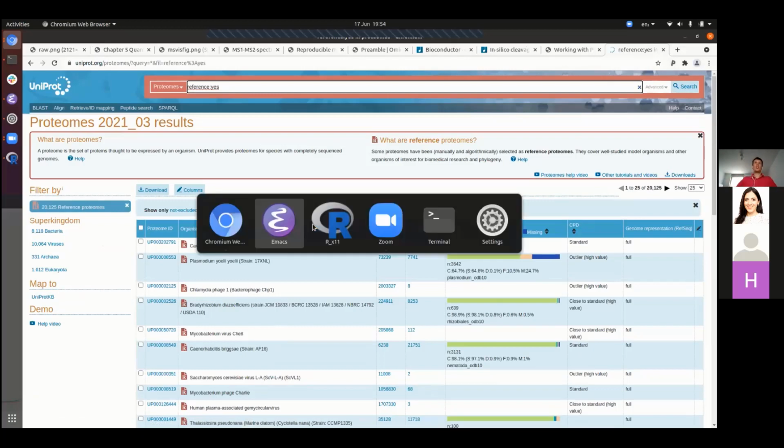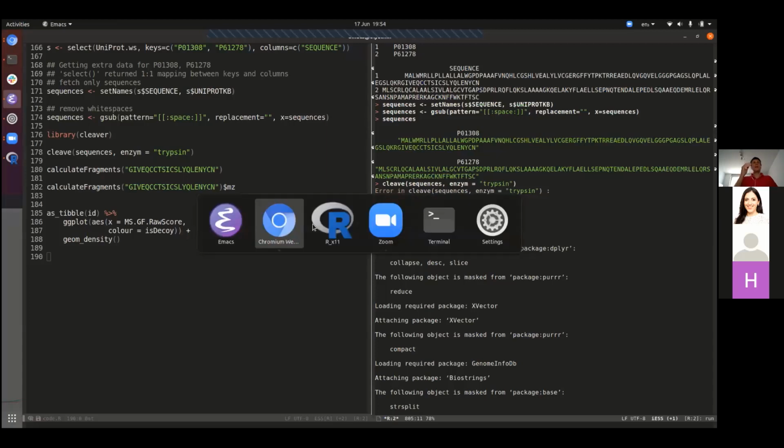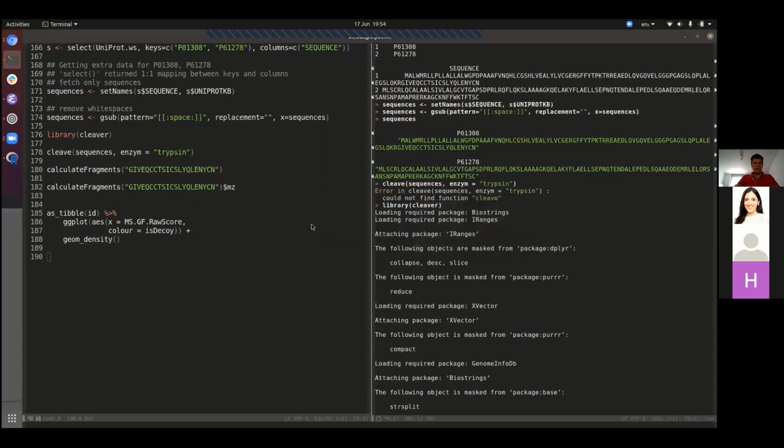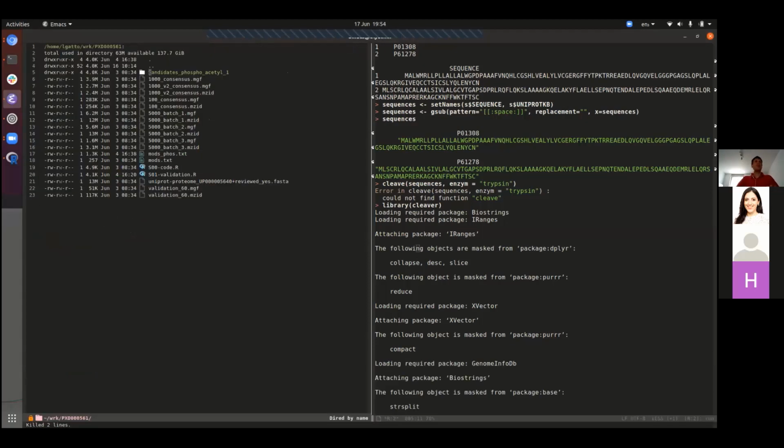Oh, I can show you actually. I surely have one somewhere here. Sorry, let me. Okay, I think. Okay, so if I open PXD, so you see PXD, this is something that we have seen.